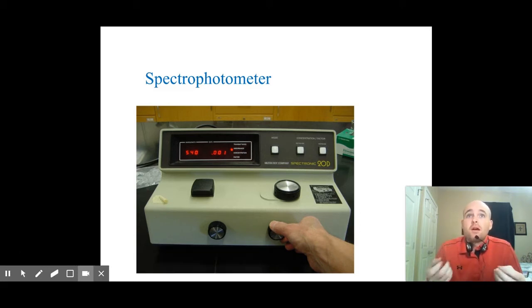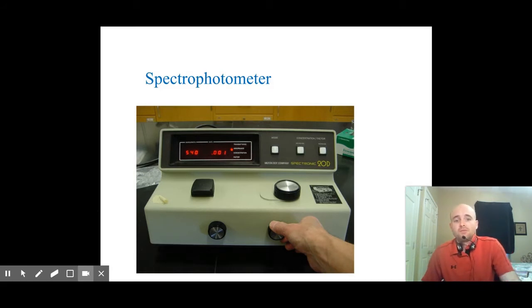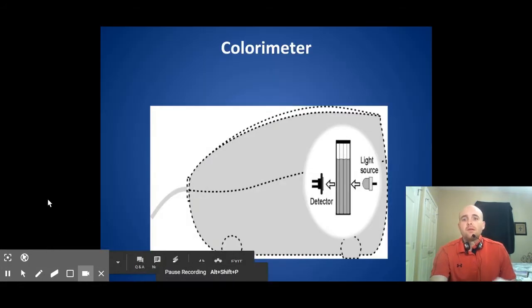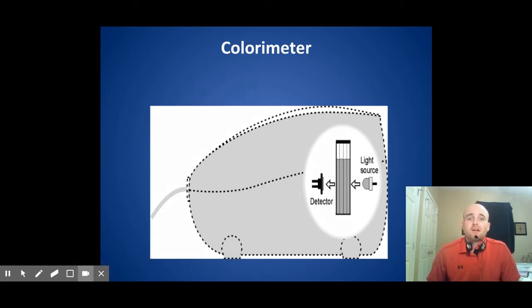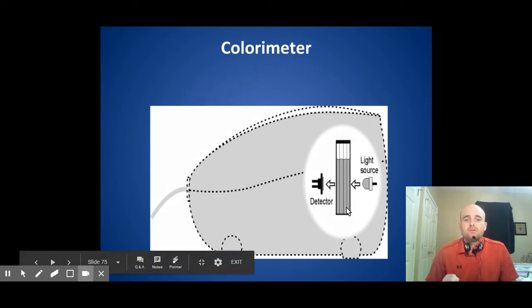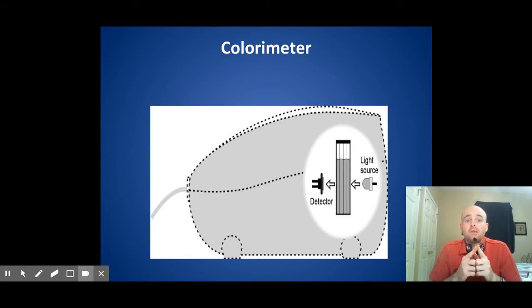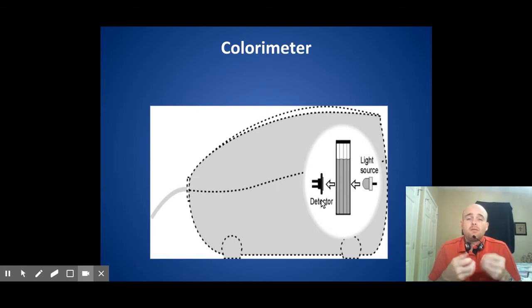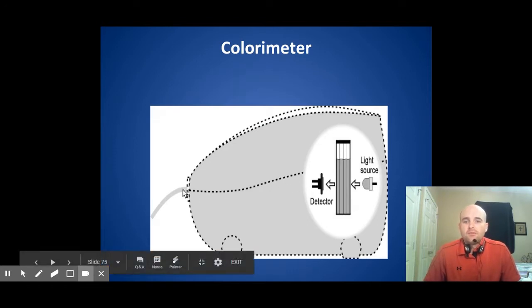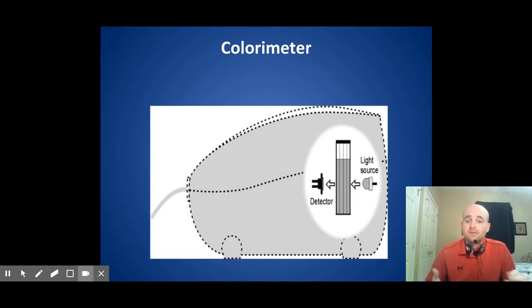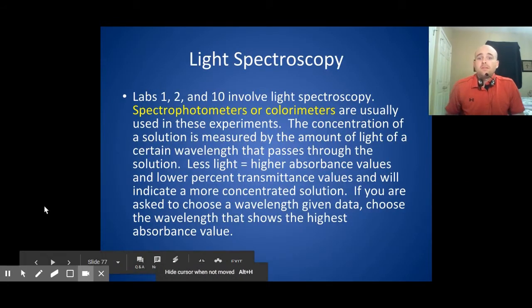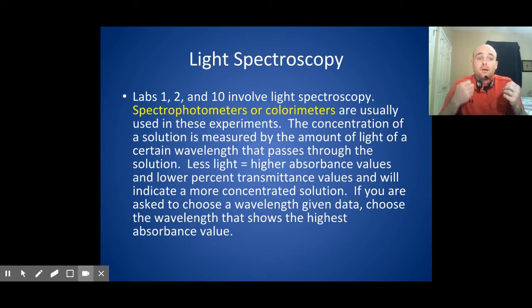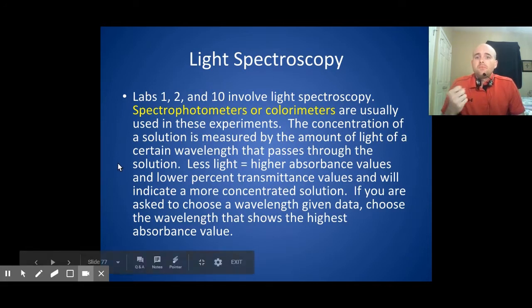But we will use a more updated model that will actually adjust it for us, which is great. And this is a picture of a colorimeter where we will insert our sample into plastic cuvettes that are one centimeter in length. The light source will shine through the sample and hit a detector, and based on how much light is absorbed or transmitted through the sample, it will send data to your LabQuest or the laptop so that it can interpolate the data. This method is really known as light spectroscopy and we'll be using it in several different labs, which is why I'm going into it in a lot of detail right now.